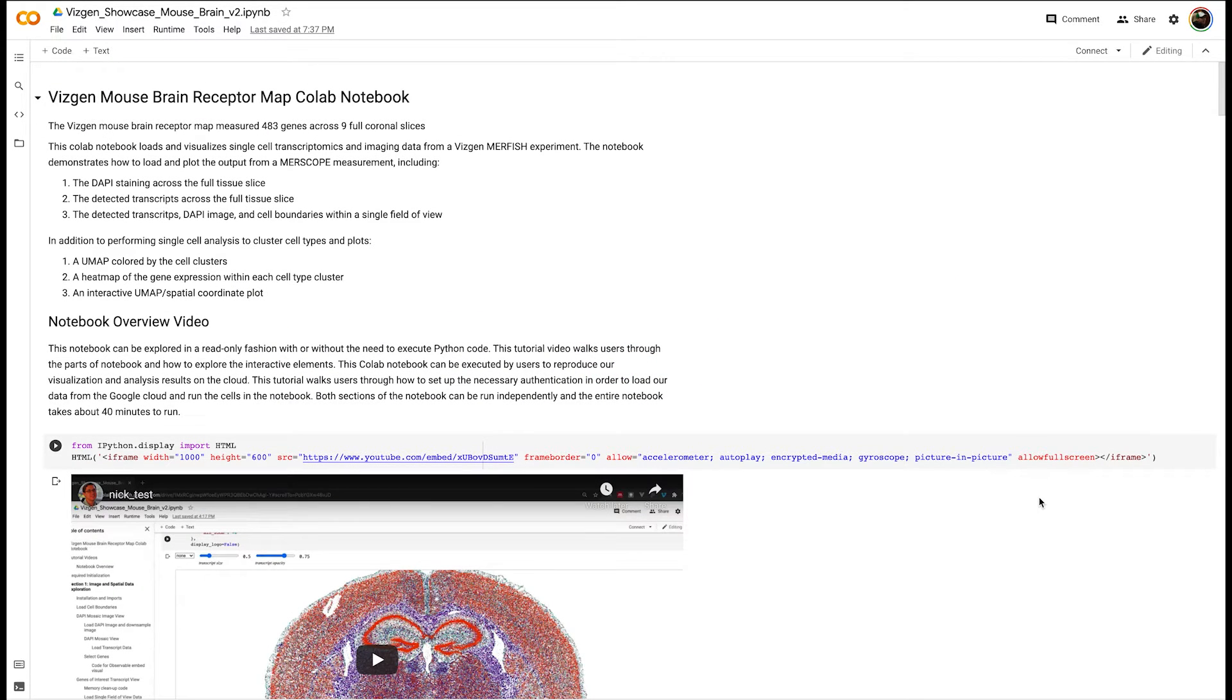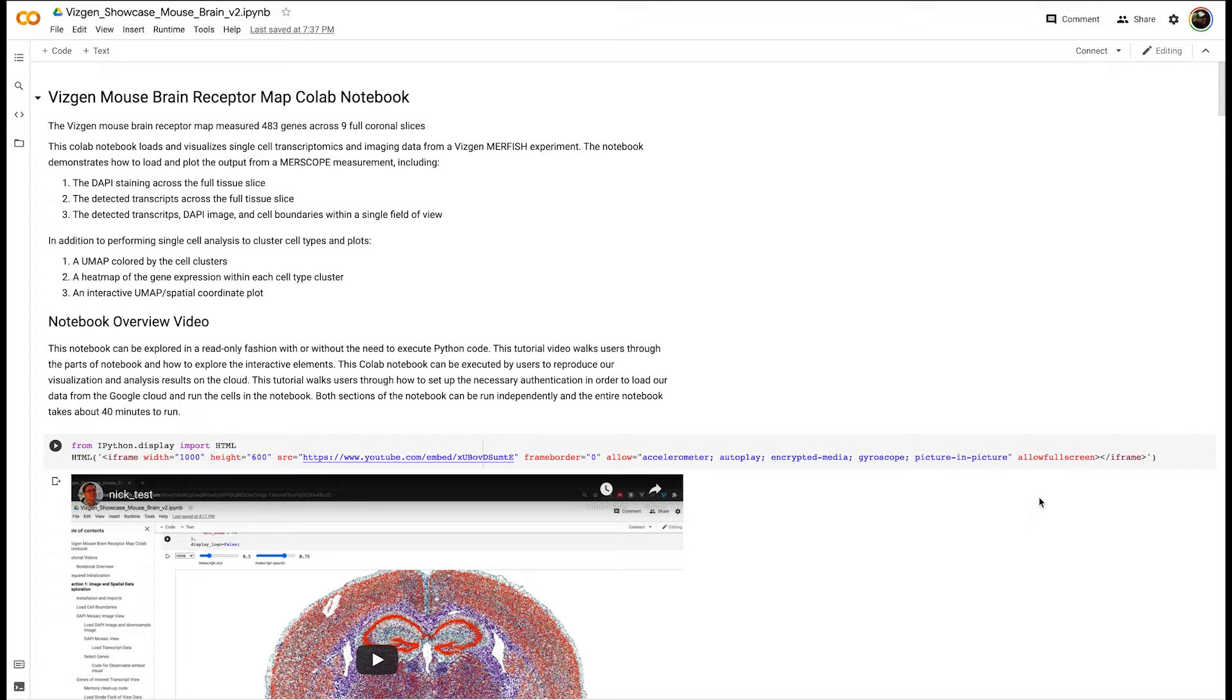Hello and welcome to VisGen's Mouse Brain CoLab Notebook tutorial video. This video will walk you through how to use the notebook, how to explore it, and how to run the notebook on the cloud using our Google Cloud platform.